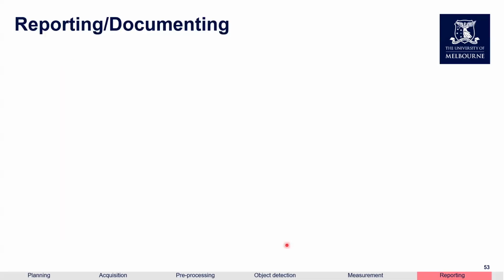When we report our measurements, we often skip over the details of the image analysis workflow, which makes it hard for others to reproduce a result. Many of you have also come across papers with an interesting method but couldn't replicate it because there are no details.